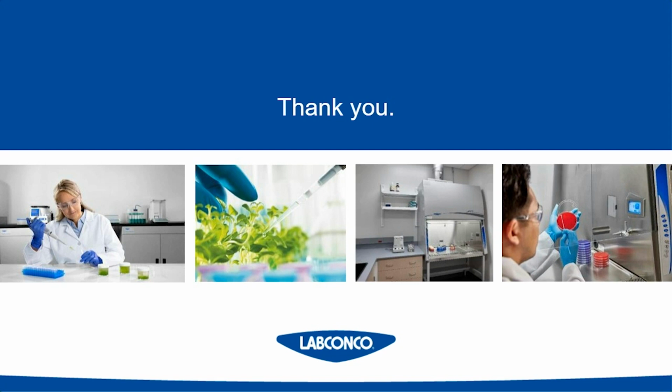So while biosafety cabinets can last a very long time, typically we would say every 15 years or so, you should probably review replacing your cabinets, just because the technology changes and the way they contain improves over time. We often get asked about the HEPA filters. How long will they last as well?